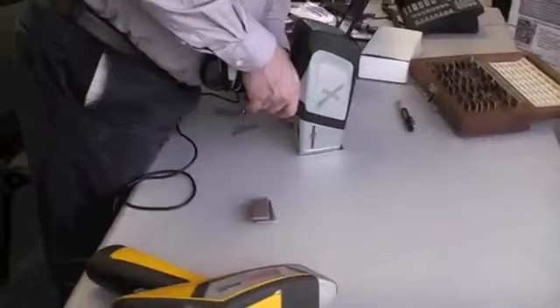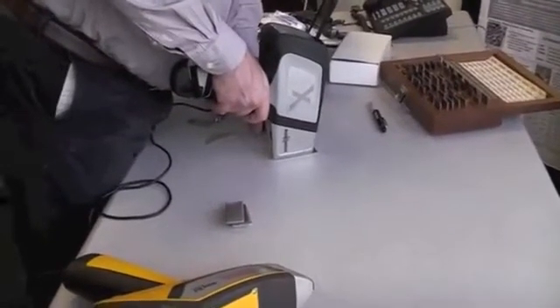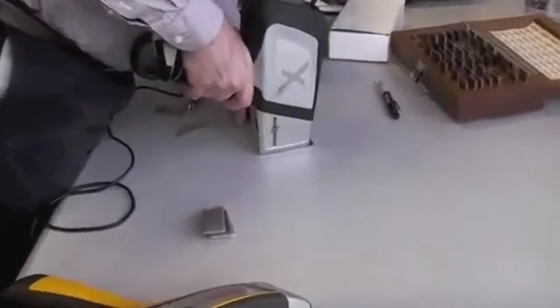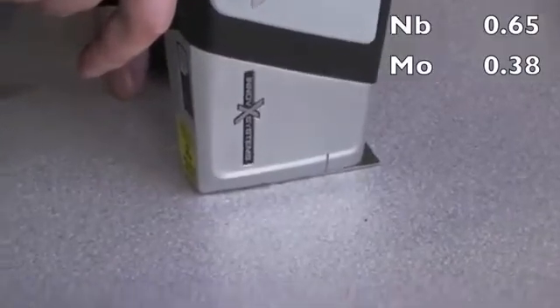We take our instrument, set it on here, do a quick test. I'll run this about three seconds and stop it. We've got niobium at 0.67, molybdenum at 0.31.